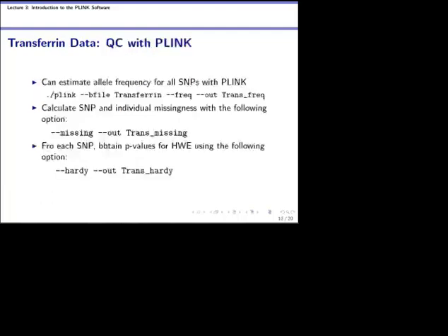And then, for example, we can estimate the allele frequencies at all SNPs. This is the command that you can use. If you have a Mac, you may want to use the period and slash to let it know where the directory is. Some Macs work, some Macs don't need it. Mine does, so I need to specify that PLINK is in the directory that we're currently in. So you may or may not need the period and slash if you have a Mac.